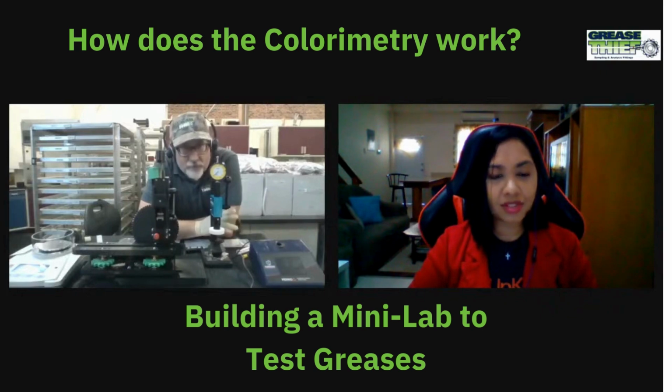So we can see both, and if we remember the values that the CIE gives us, we've got the delta E, and that's what we use. But then there's also 3 different parameters that are related to that, which are L star, A star, and B star. A star and B star are related to the hue or color of what we're looking at, and it looks at it in the red, blue, yellow. I forget what the 4th color is, but they have it broken down into 4 colors, and you're basically getting kind of a vector representation of which colors represent this. And then the L star is the darkness versus lightness.